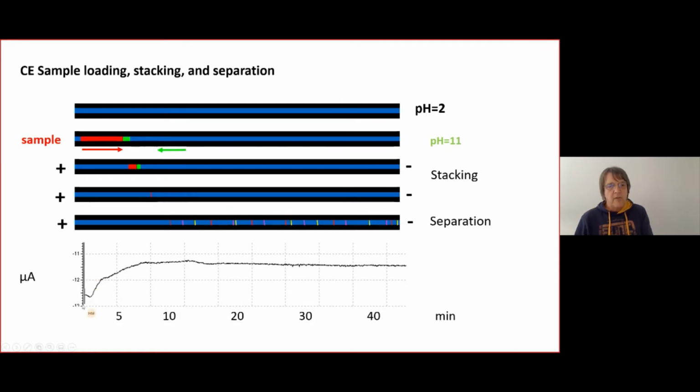So in the beginning, here you see the microamps, and we have higher microamps on the sample in the beginning to enable migration of the fast migrating ions. And this is roughly ended here, where separation starts. And then we separate based on really the charge, which is determined by the number of free amino groups, and by the mass, or let's say by the resistance to the migration in the liquid.